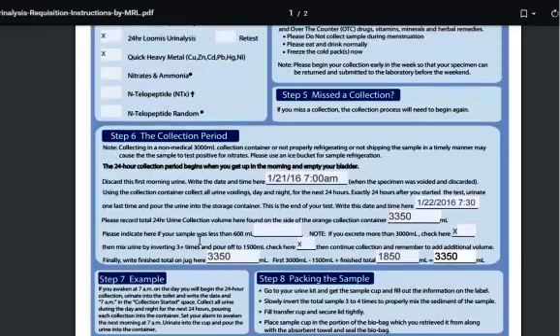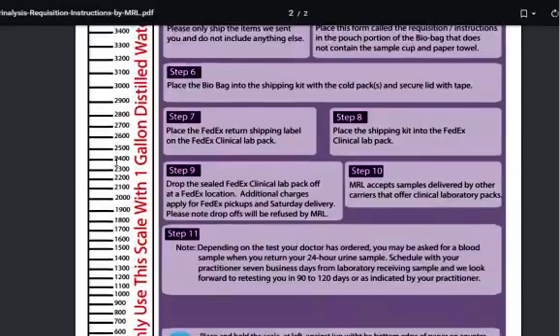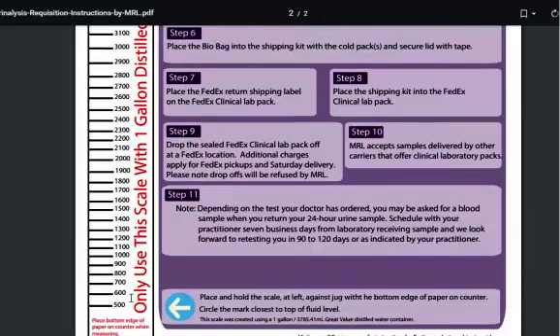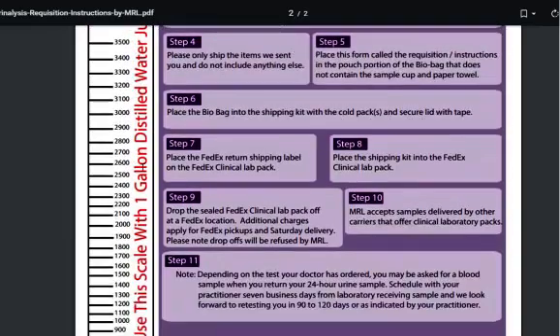Now, for example, let's say you use a distilled water jug, something we do not recommend. But most people go to Walmart and purchase the 1 gallon distilled. We want to use distilled water jugs because there's less of a chance for nitrate in the distilled water jug.